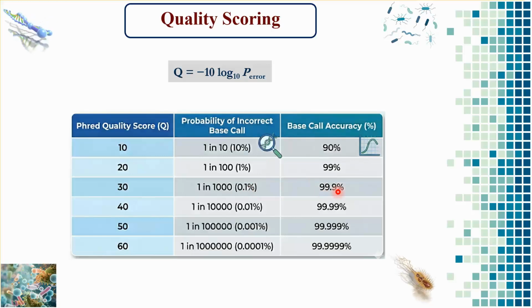When average sequencing quality reaches Q30, most bases are highly accurate, that is 99.9%, and virtually all of the bases will be near perfect, having almost zero errors and ambiguities. This is why Q30 is considered as a benchmark for quality in Illumina next generation sequencing. Similarly, a Q score of 20 means about 1 error in 100 or 99% accuracy. So higher Q score means higher confidence.